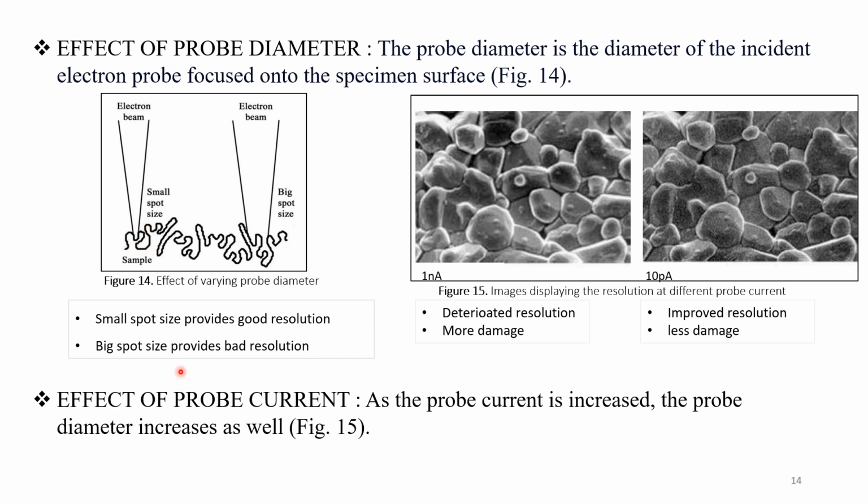Next is the effect of probe current. As the probe current is increased, the probe diameter is increased, and hence we get low resolution.